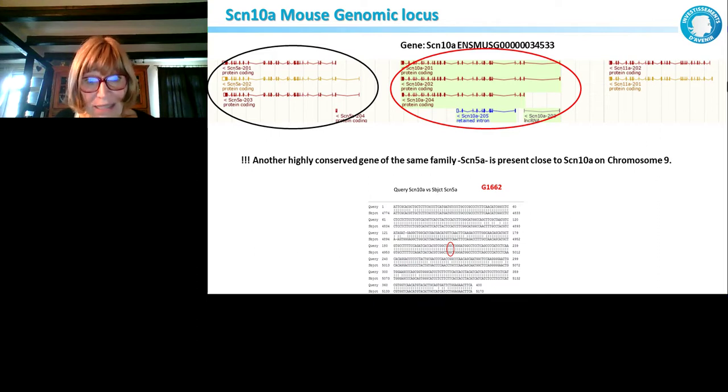Then at the site of the mutation that is surrounded on the top, on the lower panel, you can see here that you cannot choose a guide that is specific, because it will also cut in SCN5A.